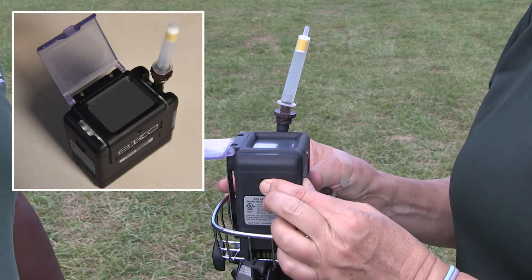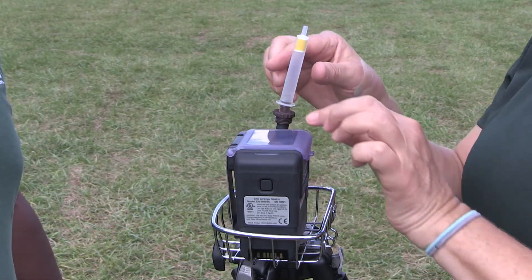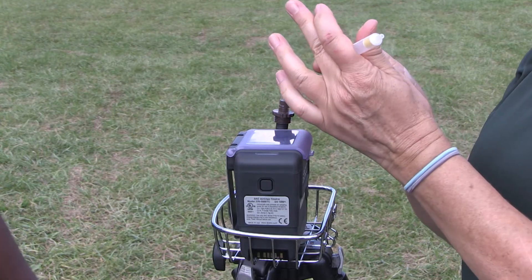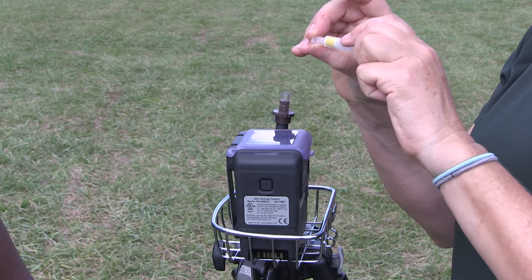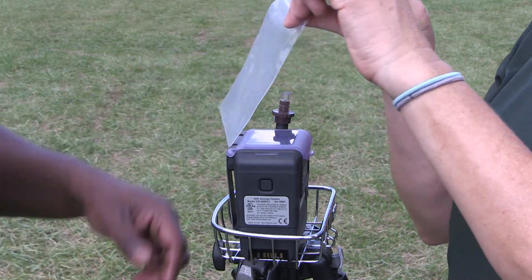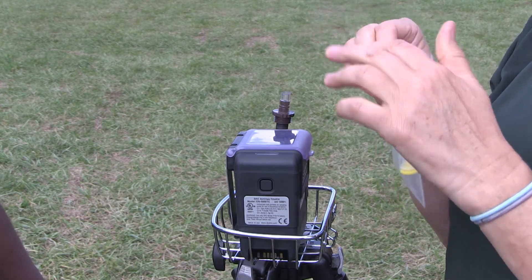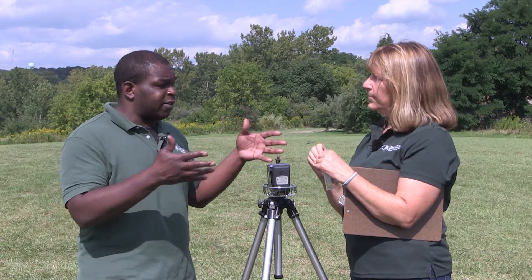Press the power button off and close up the cover. Take the sampling tube off and put the sampling caps back on the tube to protect it. Secure it, then put it back in that plastic bag. Close that up nice and tight, then put everything back in the box and send it back to the DEC regional office that you got it from.